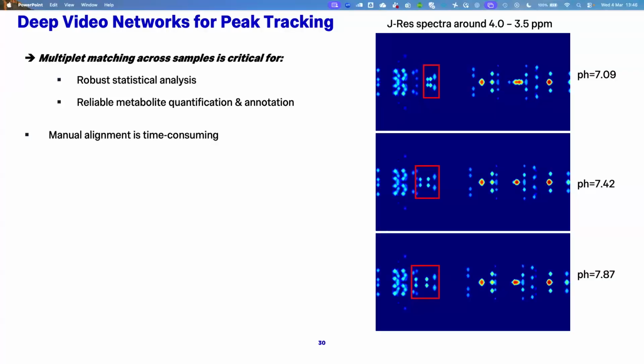And that is something that happens in real data all the time. Even though, as a chemist, you try and keep the pH as constant as possible, even small variations, smaller than we see here, will produce small variations in the peak positions, even for the same compounds. That seems like a minor thing, but it becomes a huge problem when we're trying to statistically analyze these data. What we might be doing is comparing one sample to another and seeing what's changed. If the change is just a change in position because of something like a change in acidity, that's not a very interesting change for us.